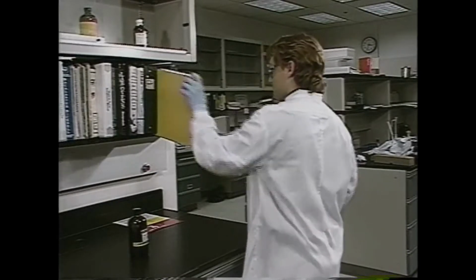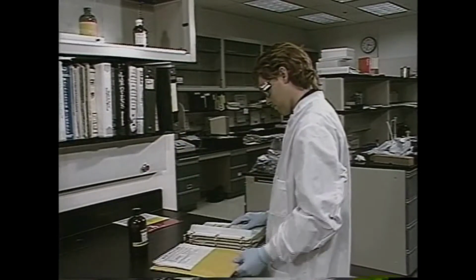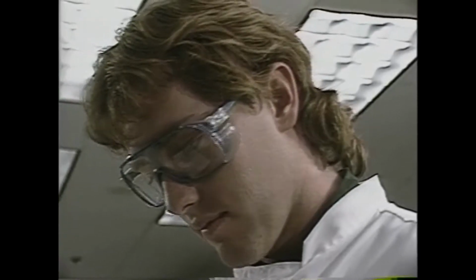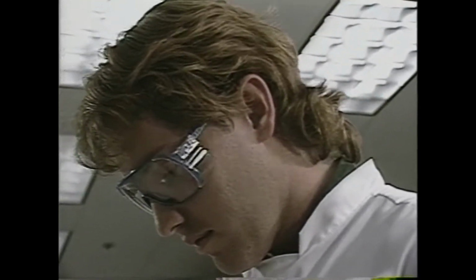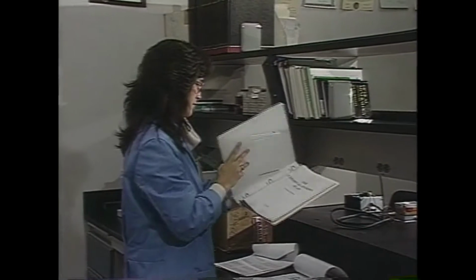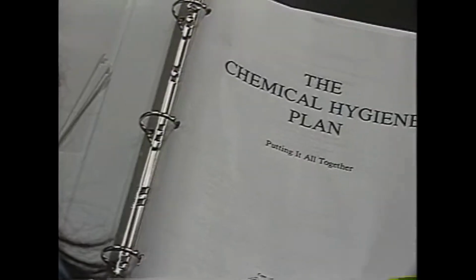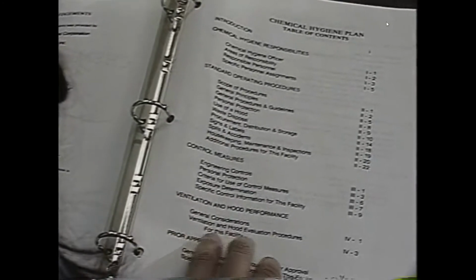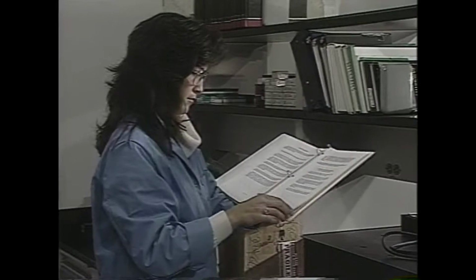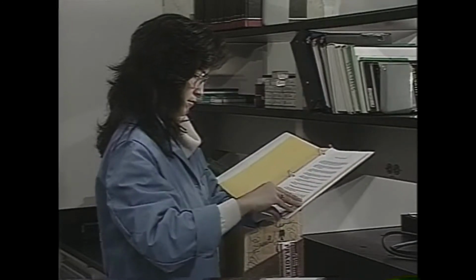OSHA's Hazard Communication or Right to Know standard helps ensure that we get the information and training we need to work safely with hazardous chemicals. OSHA's laboratory standard goes one step further by requiring employers to maintain a chemical hygiene plan. This written program identifies the procedures and equipment that are used to protect employees from hazardous chemicals in laboratory environments.